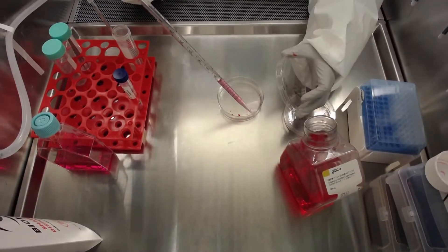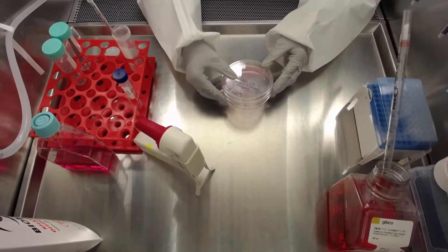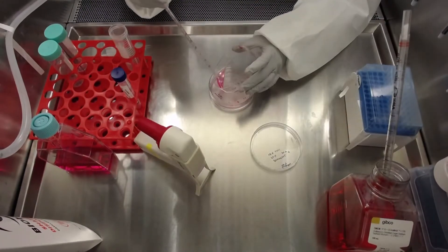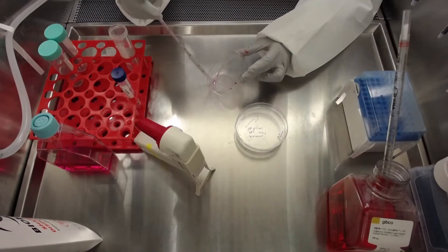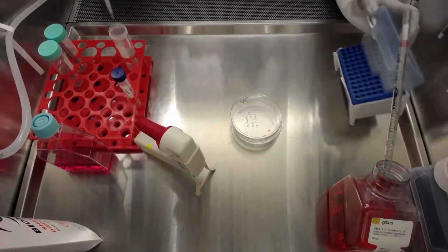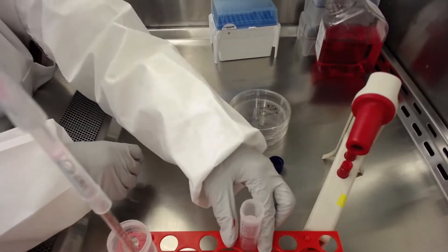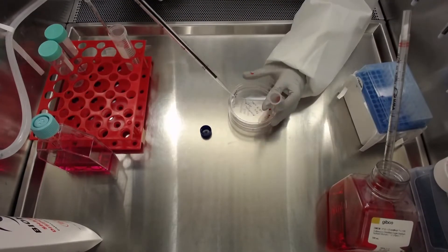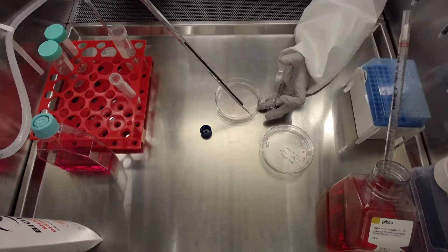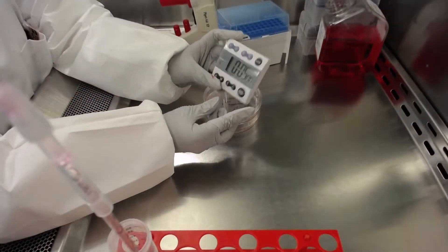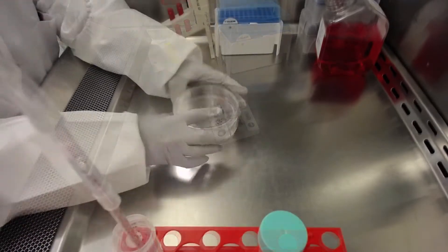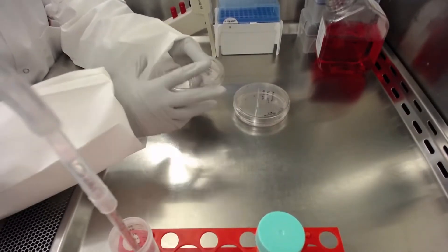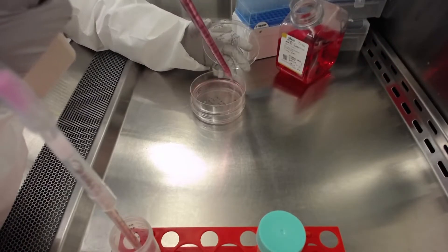Wash the cells with 5 milliliters of DMEM F12. Remove the media by aspiration and add 5 milliliters of Accutase to each dish to dissociate the cells. Incubate the cells at 37 degrees Celsius for 3 to 5 minutes. Once the colonies have detached, which can be facilitated by tapping the sides of the dishes, add 5 milliliters of DMEM F12 to stop the enzymatic reaction.